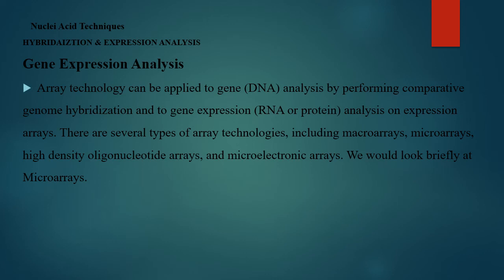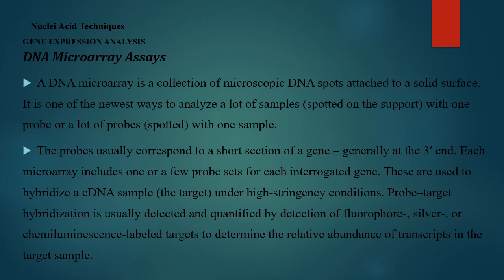There are several types of these array technologies. We have microarrays, macroarrays, high-density oligonucleotide arrays, and microelectronic arrays. But we will not look at all these. We will just look at the microarrays. So the DNA microarray assays.